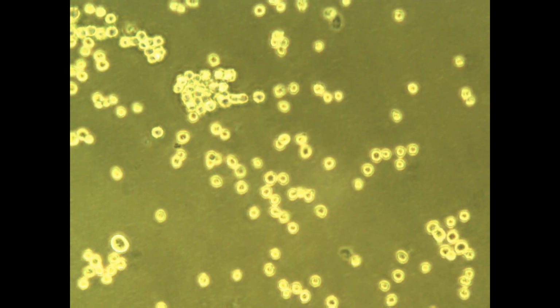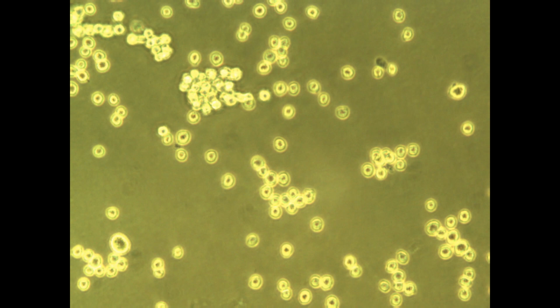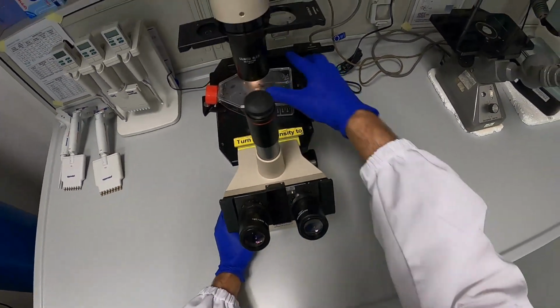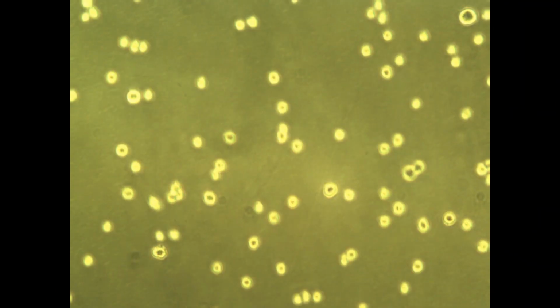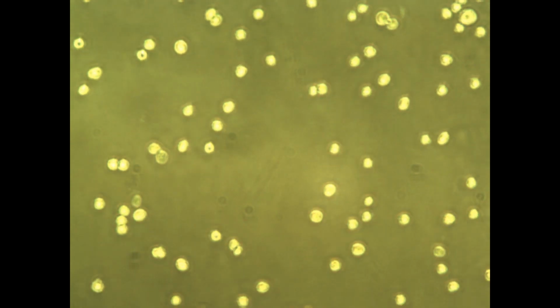Let's zoom in, just change the magnification, focus. Yes, indeed, they look completely different, don't they? They're rounded up and many of them are floating. So in order to convince them to really let go, just bash a little bit on the table and place them again under the microscope, and you see more or less all of them have detached.